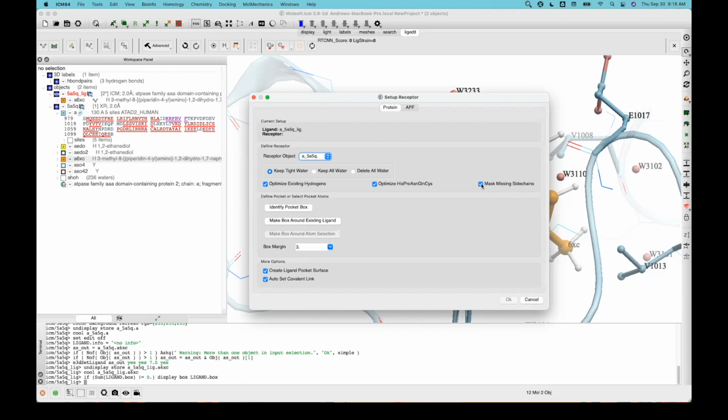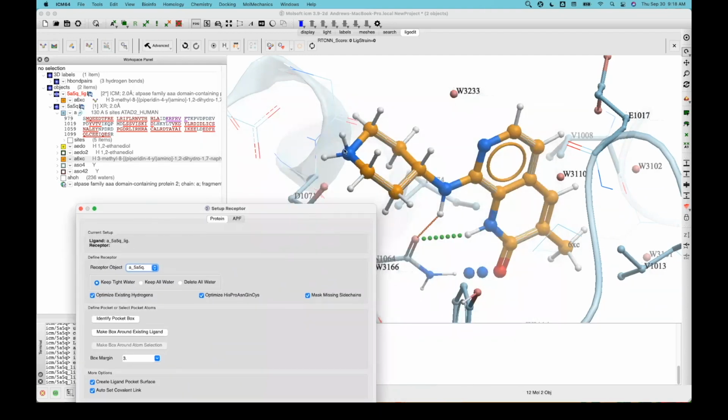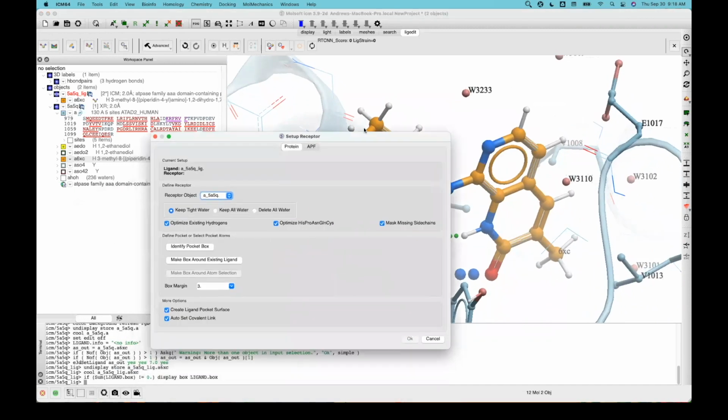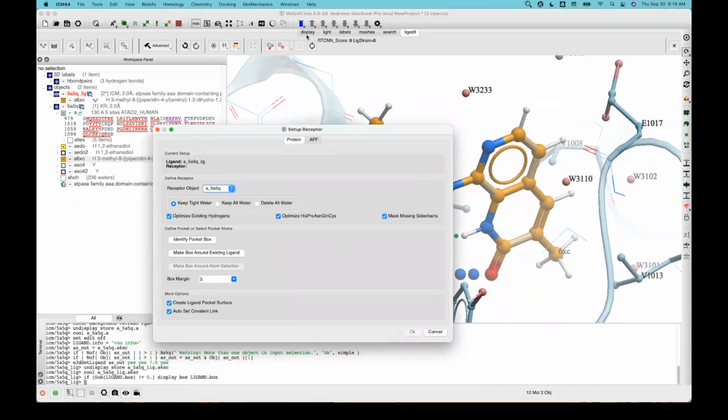But in this example, we have a high resolution structure, so the occupancy of the pocket is very good. If you look back at other tutorials, you can see in the display there are different ways of visualizing occupancy and B factors and things like that in your protein structure.